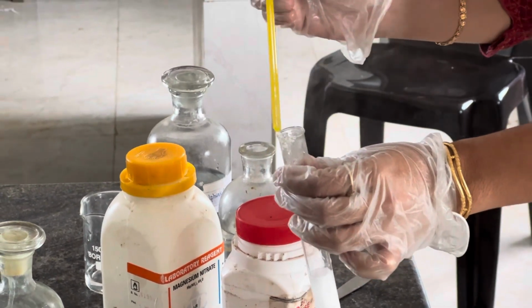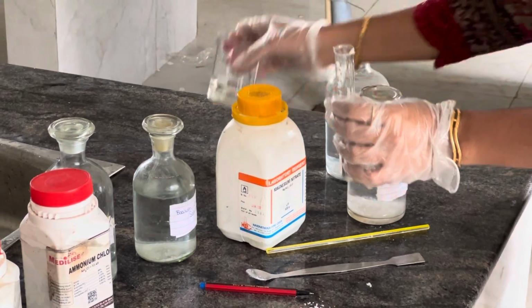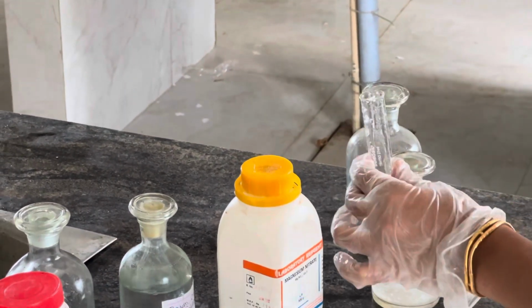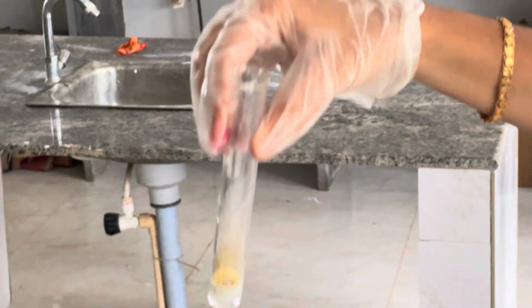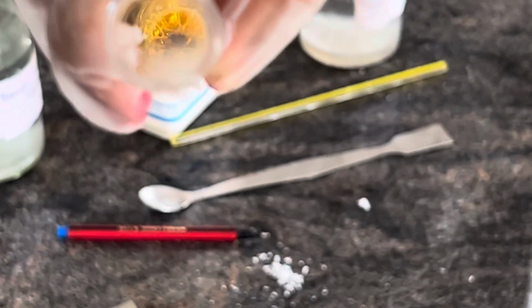So first we tested for carbonate, that was another salt. Then I took another salt and tested for chloride with concentrated sulfuric acid. If it gives dense white fumes, it means chloride. Again I have taken another salt and added concentrated sulfuric acid. Here there are no dense white fumes, so the salt does not have any chloride. And I am adding a paper ball. When I add the paper ball, if I get a brown gas or the solution turns brown, then it infers the presence of nitrate. Clear? So here nitrate may be present. And again you have to go on for the confirmatory test for nitrate.